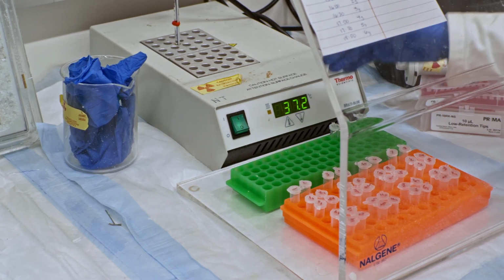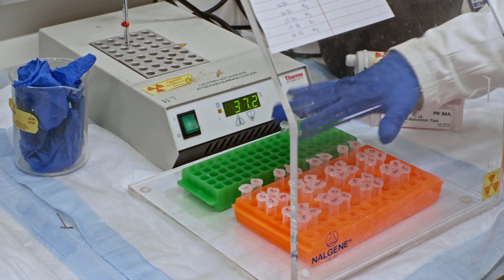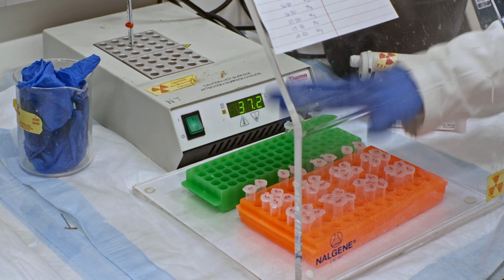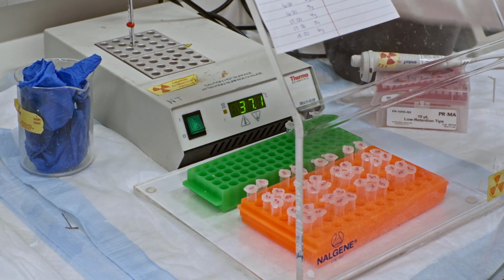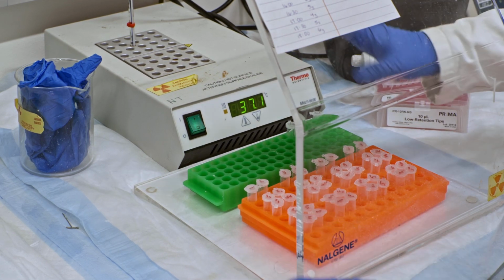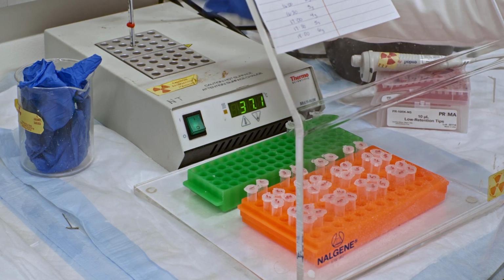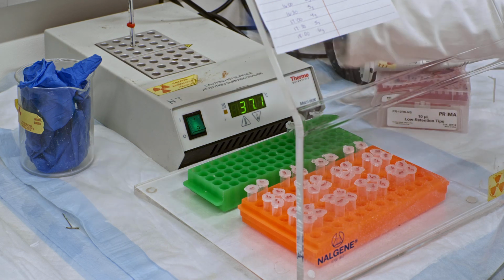And if you're wondering why, it's because we're about to incorporate DNA primer templates that are radioactively labeled, and so you would want to do this behind the blocking screen. However, whenever we put these radioactive DNAs into these samples, they are now going to stay here, not back on ice. Because if you think about it, you can accidentally pass radioactive material into the ice, and then you've contaminated the ice, and then you have contamination all over the place. And second, of course, once you add your DNA, the next thing you want to do is incubate it on the heat block anyways, and so this makes it convenient: once you've added your DNA, you put it on the heat block, and you're set to go.